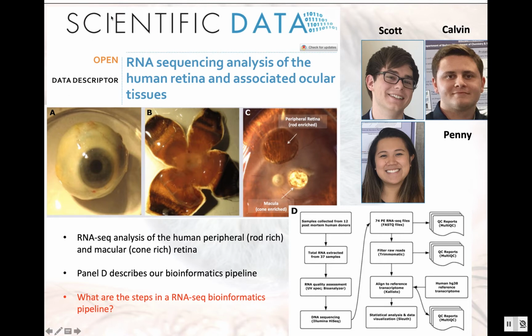So again, I'm talking about in this video a study that we did in my undergraduate research lab characterizing the mRNA transcriptome of the human retina. We have some central macula and peripheral retina, so some cone and rod photoreceptor enriched samples that we've taken from human donor eyes. These are my three former undergraduate students, Scott, Calvin, and Penny, who are all involved in aspects of this project.